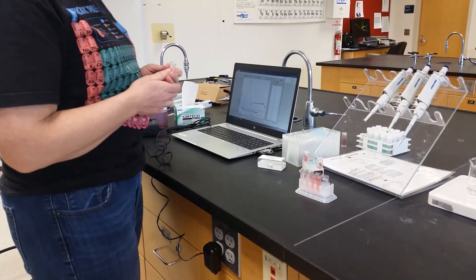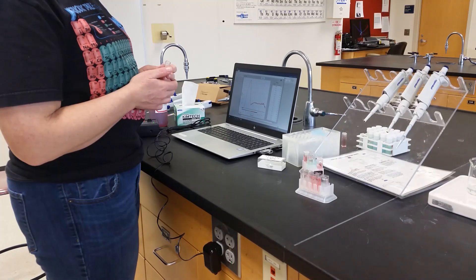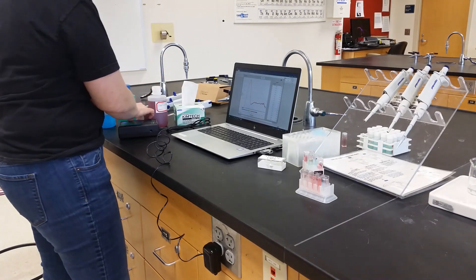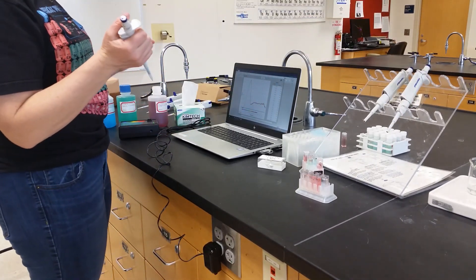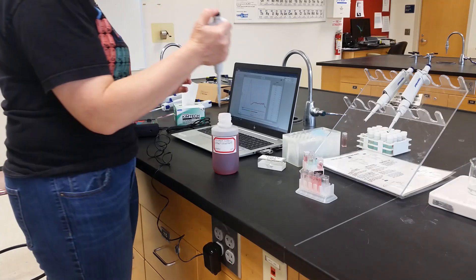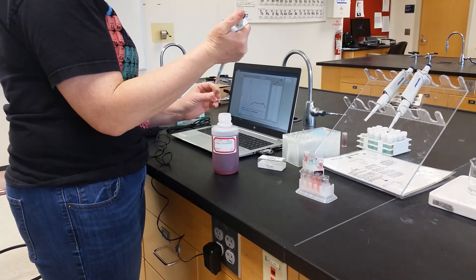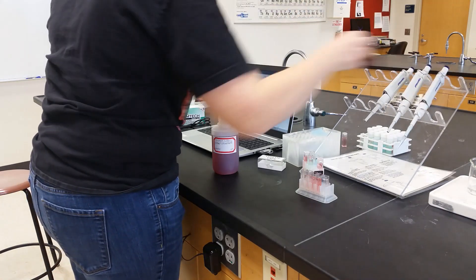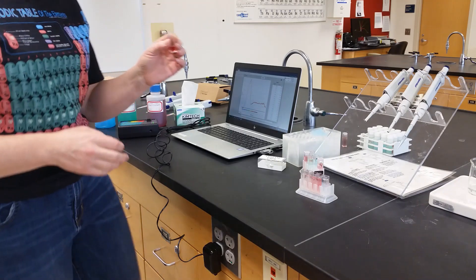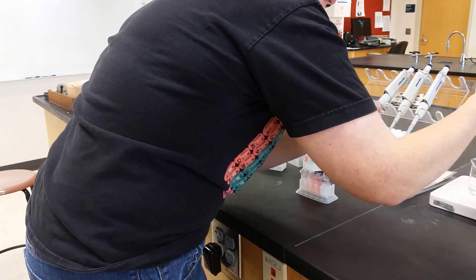Alright, we're now going to work on preparing the calibration curve for this lab to determine the unknown concentration. I've already prepared solutions one, two, and four. I'm going to show you how to prepare solution three. I do not have a repipetter, but I do have my Eppendorf. So I'm going to take one milliliter of our stock 0.25 molar solution — dispensing twice out of the 0.5 milliliter setting. We're then going to add two milliliters of water into the same cuvette.